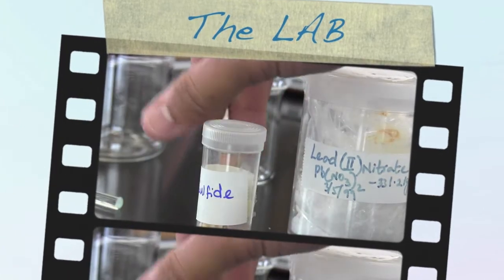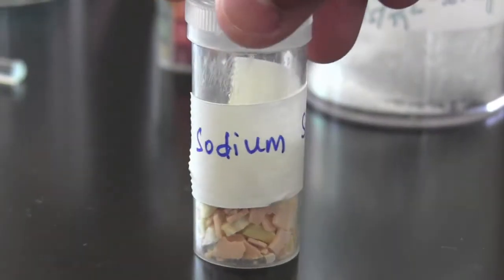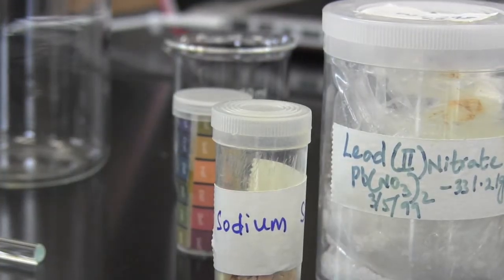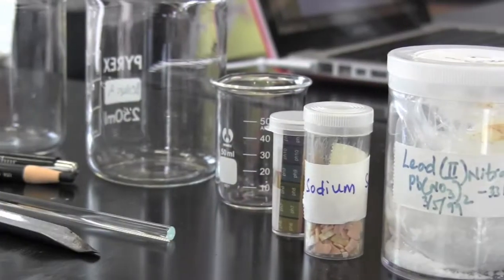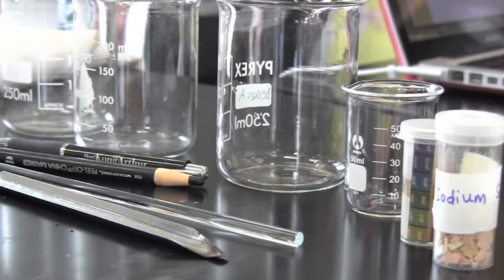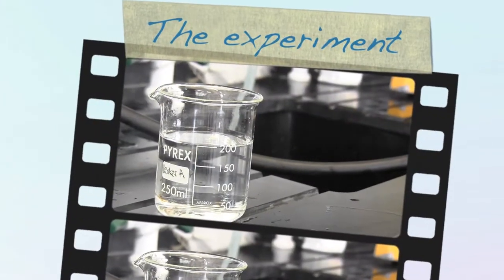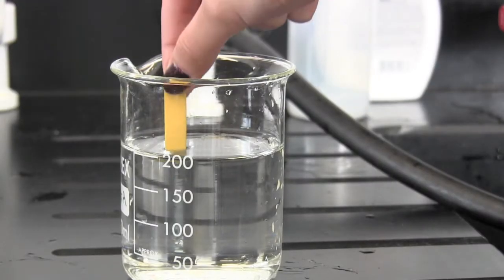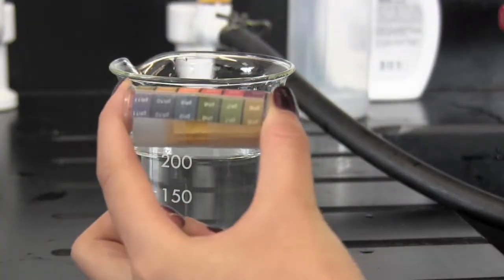Our materials for this lab were lead 2 nitrate, sodium sulfide, pond water, distilled water, drinking water, various sized beakers, scale, and pH strips. We poured 200 milliliters of water into beaker A and tested its neutrality with litmus paper.